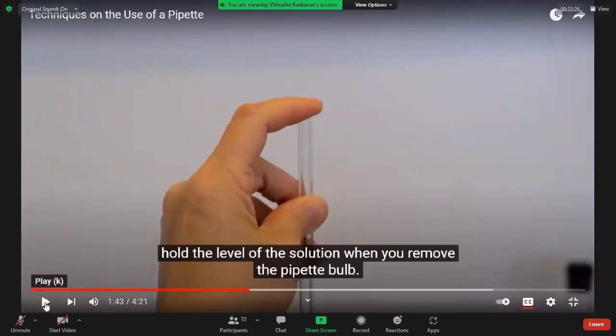Okay, for holding the solution inside the pipette, you can also use your thumb instead of this index finger.